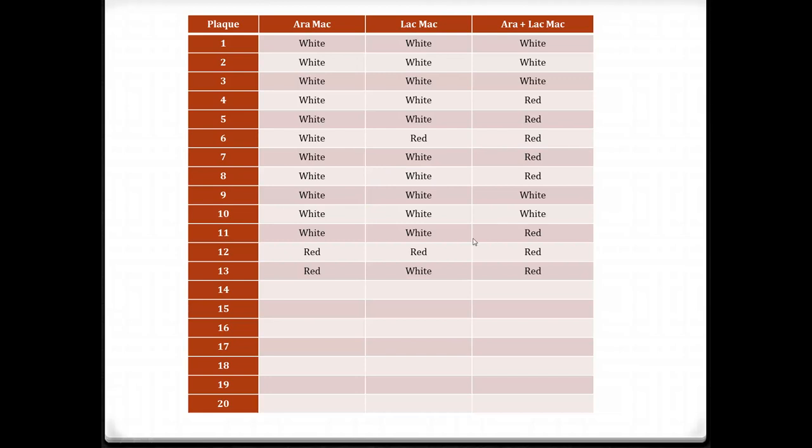And remember how to patch. It's exactly like in the strep lab. You take a toothpick, you touch the colony, and what you'll be doing on these is touch a colony, patch, patch, patch, stripe, stripe, stripe. Right? So you'll be going back and looking at the stripes. Don't make little dots. Make a nice big fat stripe so you'll be able to look at these and tell. What are you looking at? Nice big fat stripes. You have a nice picture if you decide to use this one for your poster. Remember, photo document everything.